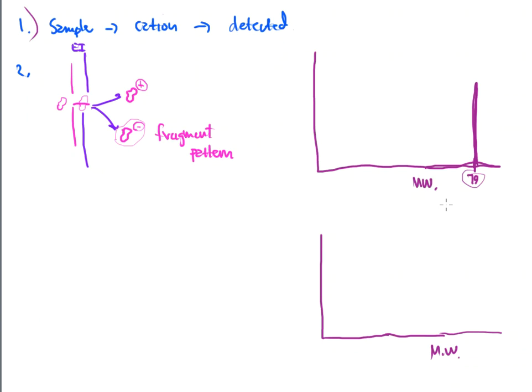But sometimes this molecule comes in, it will get into a fight, it wasn't ready for it, and it loses more than just an electron. It actually loses a piece of the molecule. So yeah, some do come through, and we do see a signal here at 79. But we could start seeing lines and signals show up at other places as well.